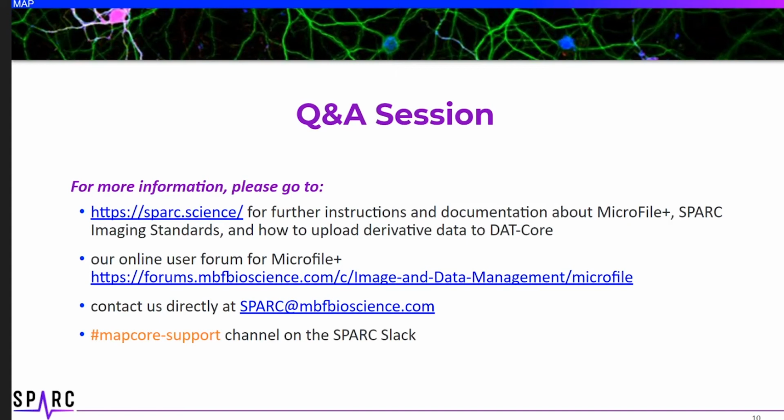If it's a 2D image, it will report and record the XY scaling. If it's a multi-plane 3D image, then the Z scaling will also be transferred. If you don't know, but you do have a micrometer from an older setup, we can help you through the process of figuring out what the microns per pixel scaling is. Just post a question on the forum and we'll provide some explicit instructions.